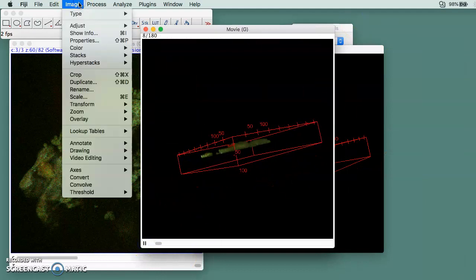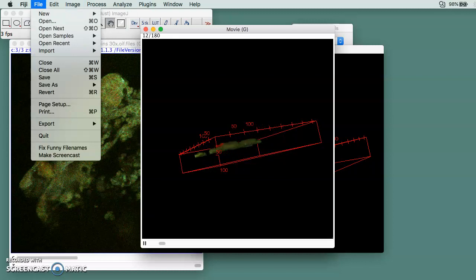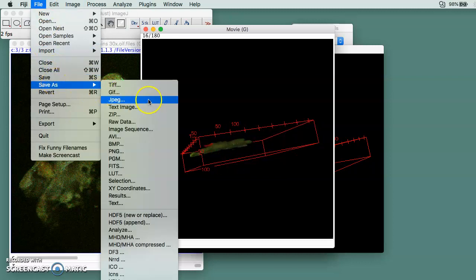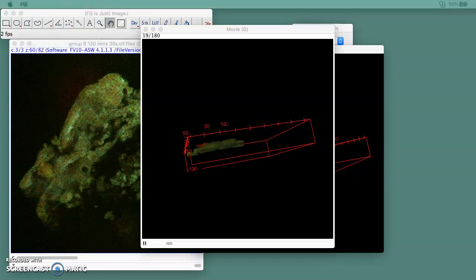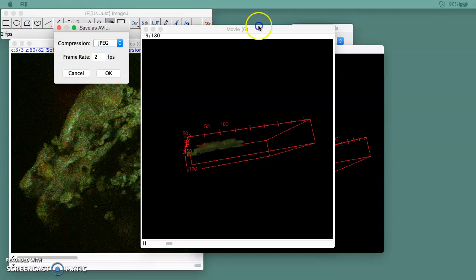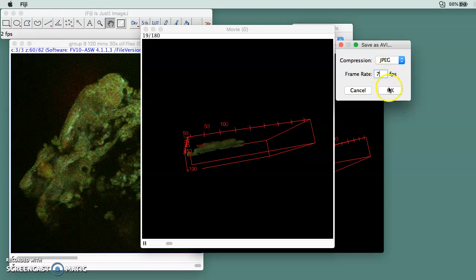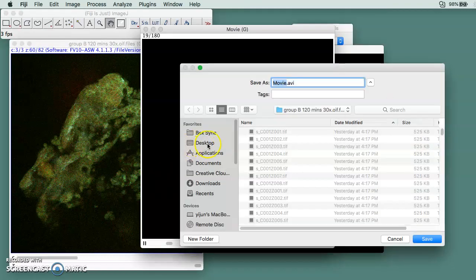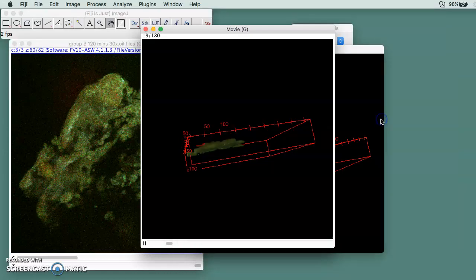Then you can save it. Go to File and then Save As AVI. You do 7 frames per second, click OK, and then you can go to Desktop and save.